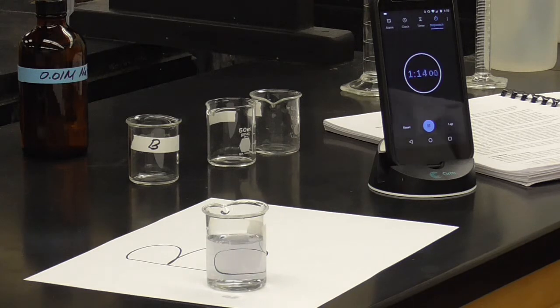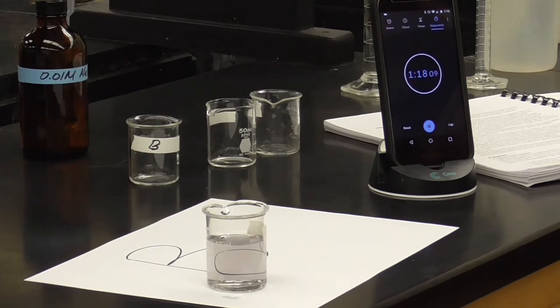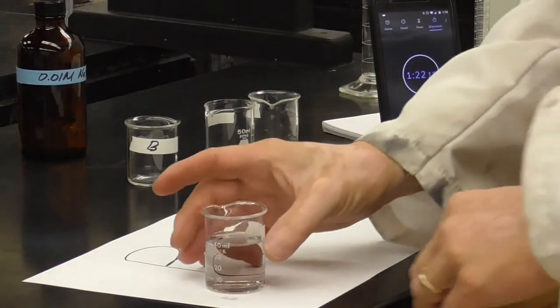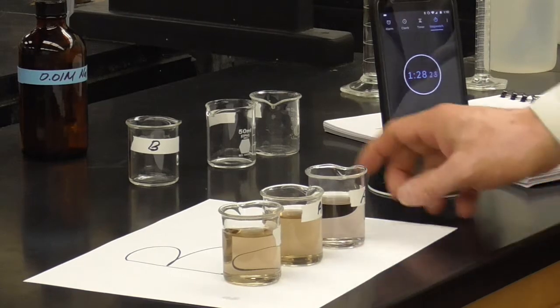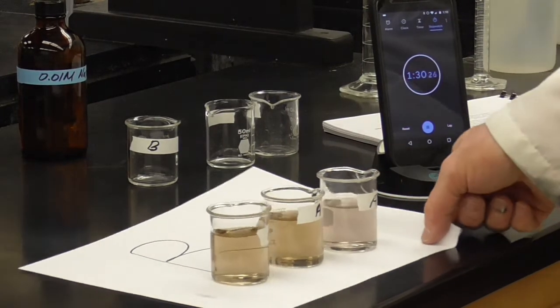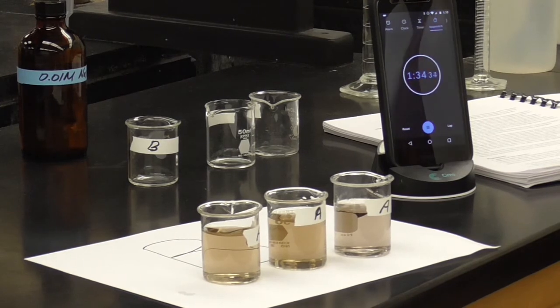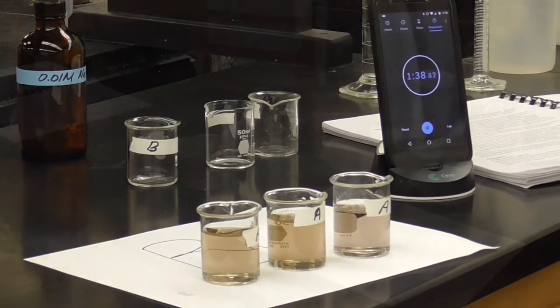There we go. Color change. So let me just line these up. You see the color change, and this one is still solid, but you get the same color, more or less, finally for all 3 of them. But the kinetics, the timing of it was different because the concentrations were different.